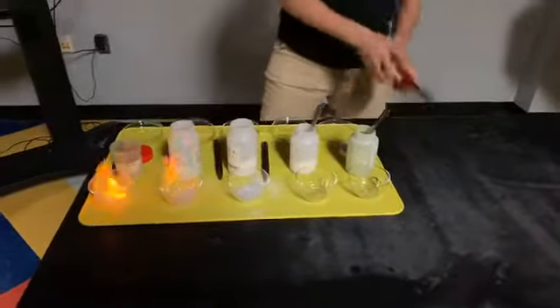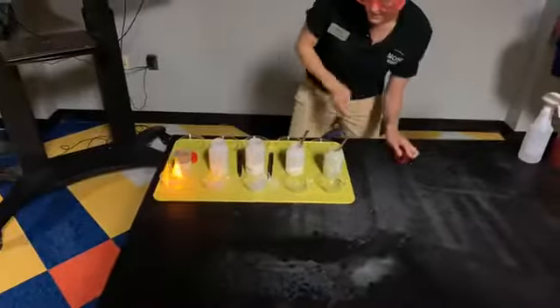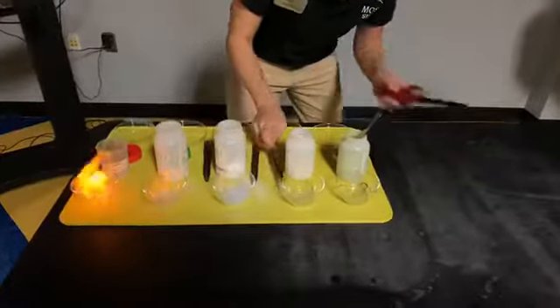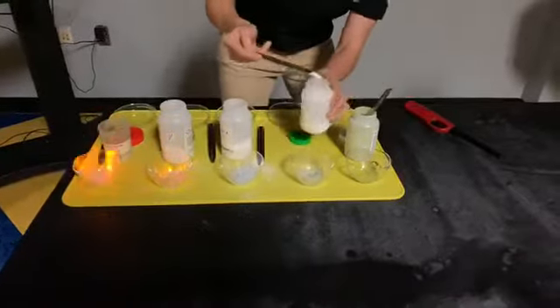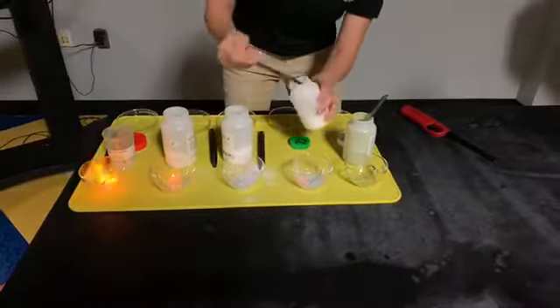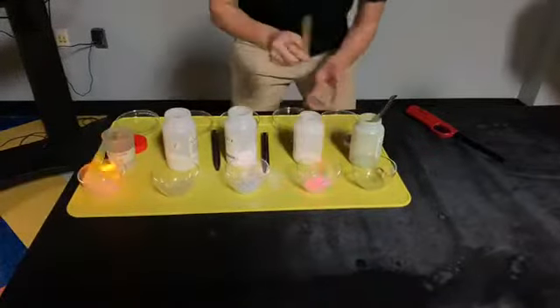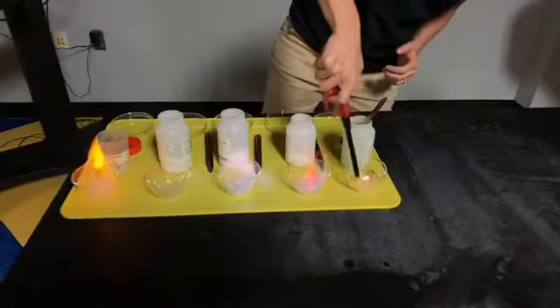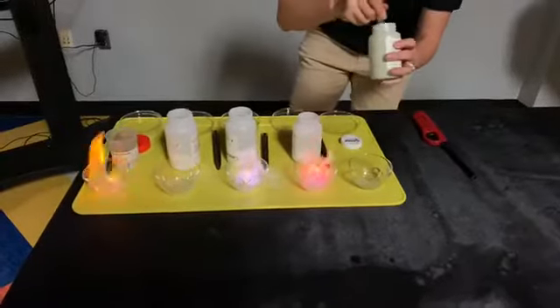Now, what I'm doing here is actually something that scientists occasionally perform in a lab called a burn test. Different chemicals burn different colors due to their chemical makeup. So, let's see if we can get a nice, I think this one should be pink. There we go. This one is lithium chloride, extremely volatile substance. So we have to be careful with it. And yeah, scientists can do these things called a burn test to figure out what chemical they have by burning it. But it's not only a good investigative technique.